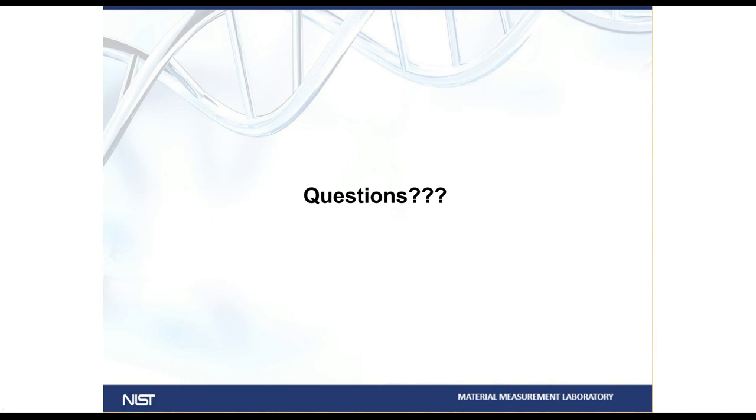Thank you, Paul. And I believe the questioner has just clarified his question. Have other interlab studies been done with ERF to improve? We are working with certain laboratories who are interested in doing their own ERF assignments, but so far we've been doing that on a one-on-one basis because at least to this point there didn't seem like a large interest from the original participants to quickly do this kind of round robin again.